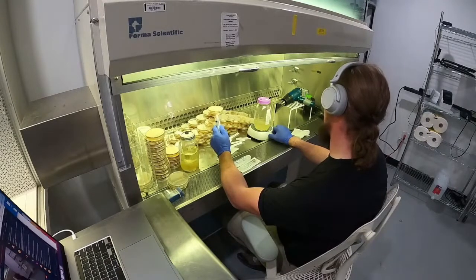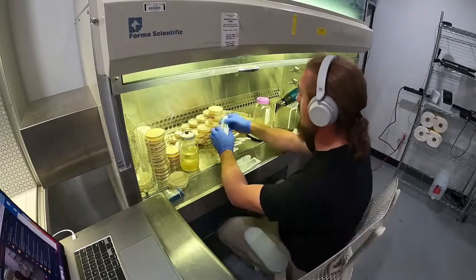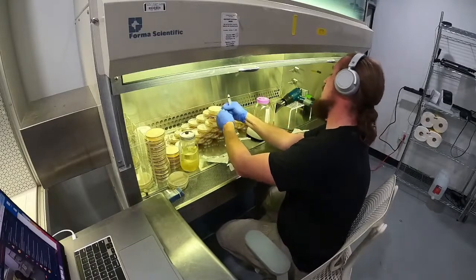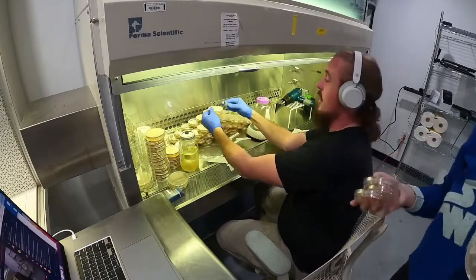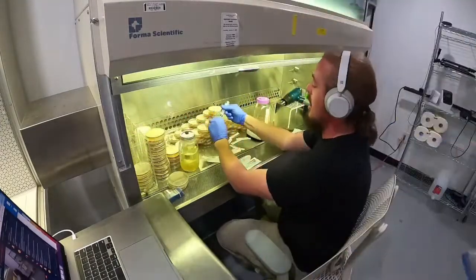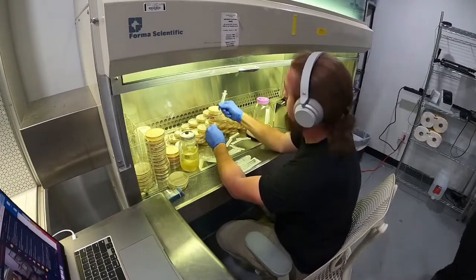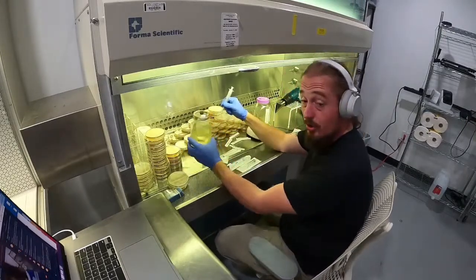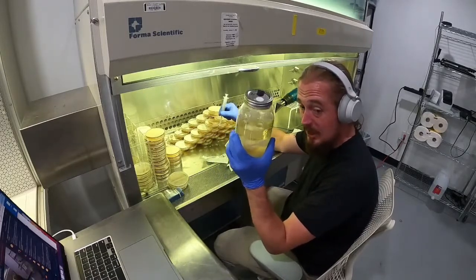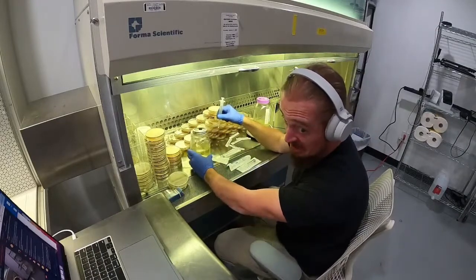But while I'm doing that, I'll go into agar to grain versus liquid culture. The big thing with agar is that you don't have a lot of biomass, because honestly, there's not a lot in that agar. Meanwhile, this liquid culture is a solid quart of living mycelium. This looks clear, but it ain't clear. There's mycelium in there, right?